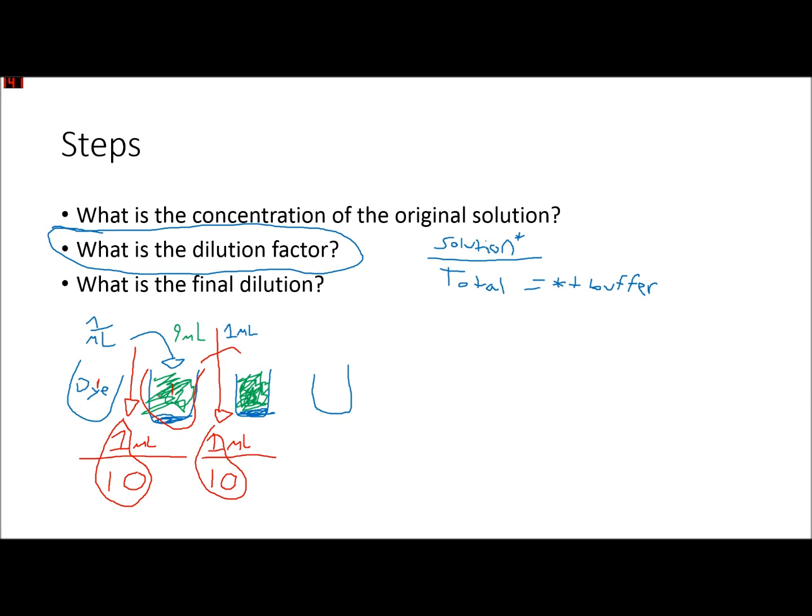So that means that, let's do colors again. This is starting to get a little complicated, but hopefully you can keep it straight. So here, this solution that we first made is 1/10 as strong as this pure solution here. And this dilution that we made third is 1/10 as strong as the second one.